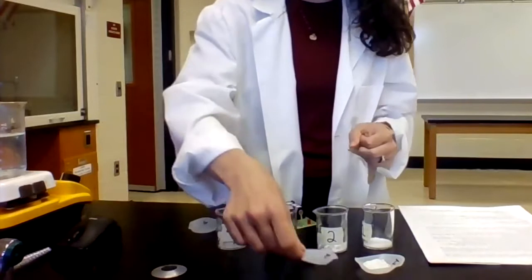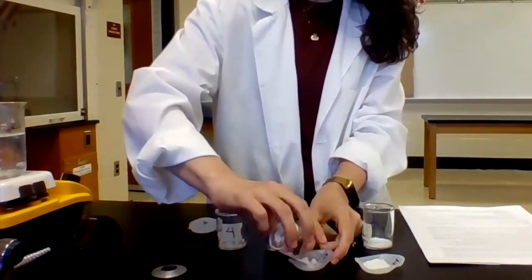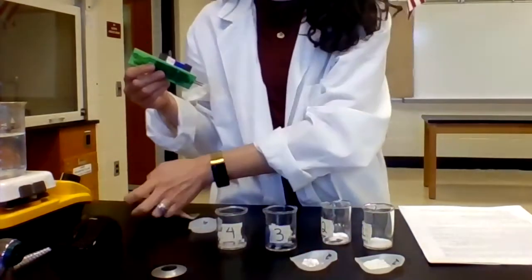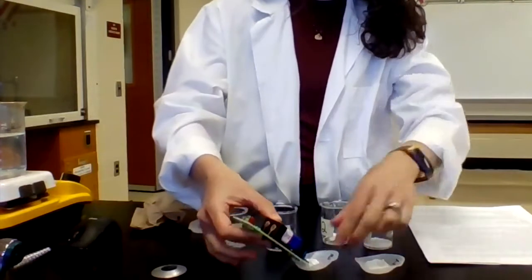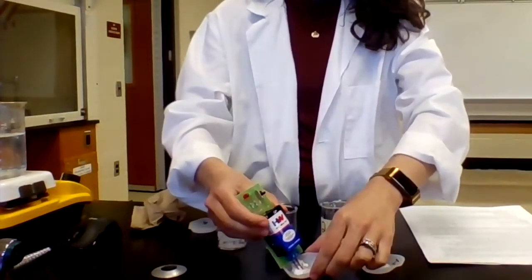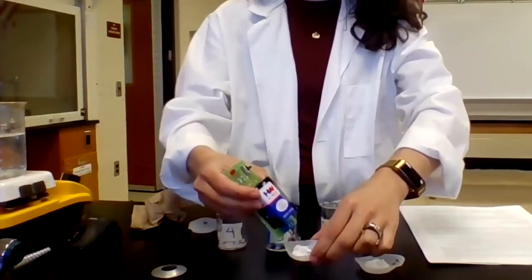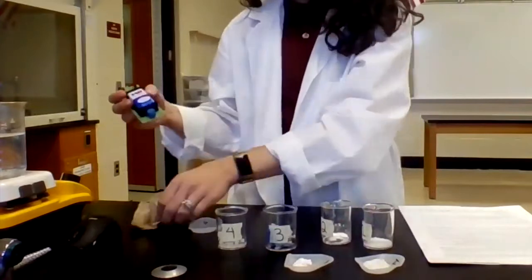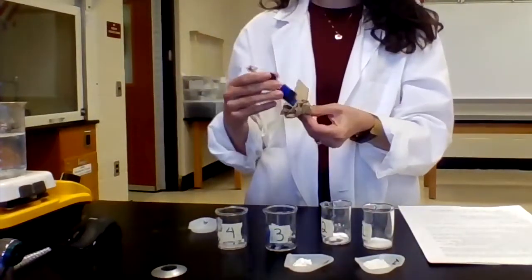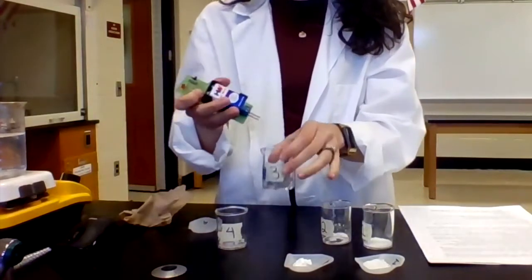Now I'm going to take solid 2 and do the same thing, because again, the probe doesn't fit very well in the beaker. Again here, we're seeing it's not lighting up. So this is telling me that solid 2 is not a metal. Probably also can get that from its appearance, but we still want to make sure that it's not conducting in the solid state. All right, next we have solid 3.